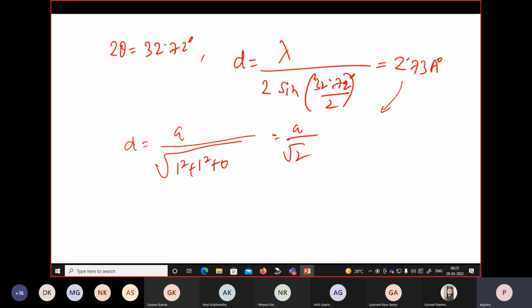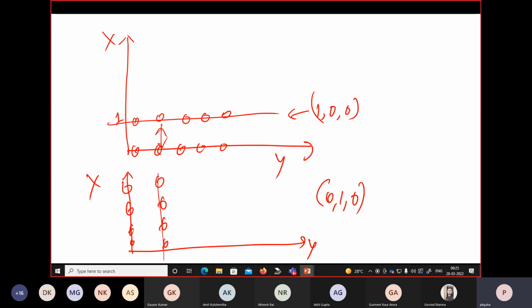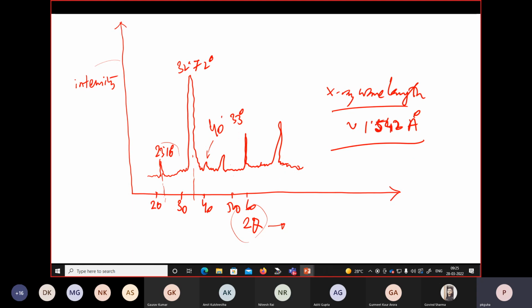So this is how you interpret XRD patterns and find out different crystalline planes. These are very important because when you prepare your nanomaterial, you might end up with very specific planes of your nanomaterial, and depending on the plane, the property of the nanomaterial or nanostructure might change.